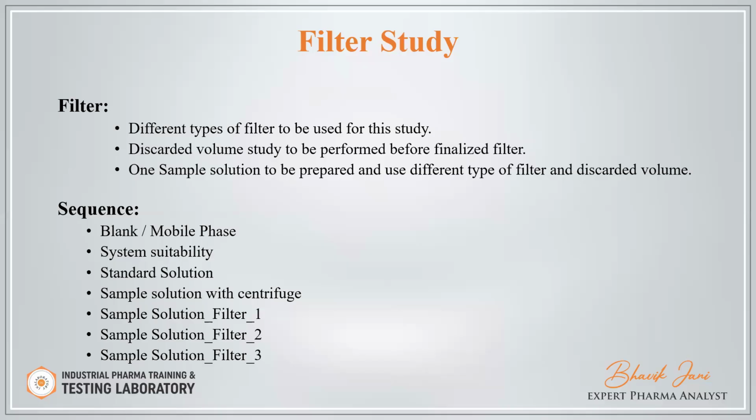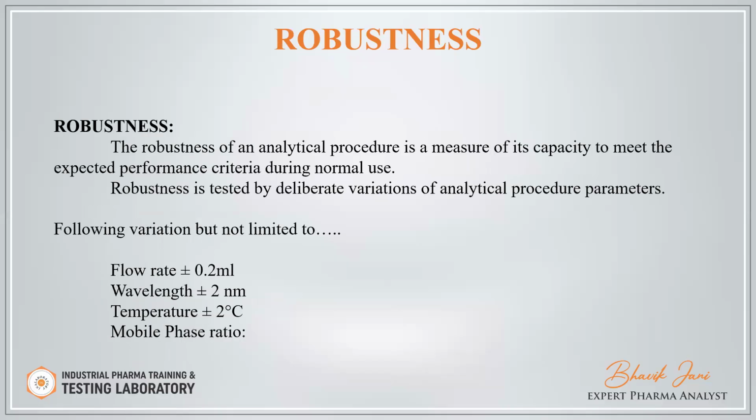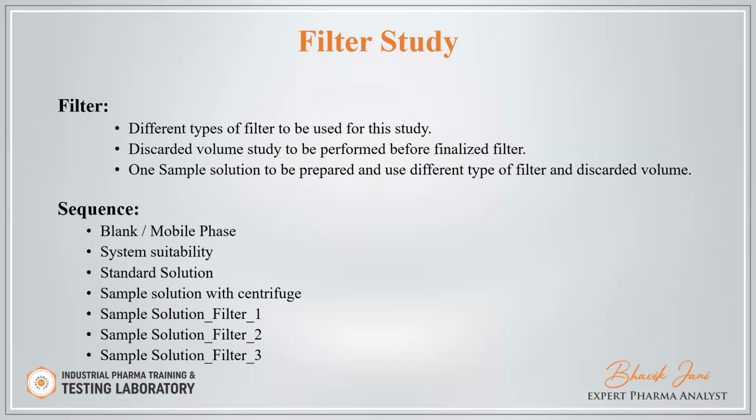Like, first you centrifuge the sample solution. Then you can use filter one, filter two, filter three, and calculate the difference between each filter. Then you can finalize your filter.